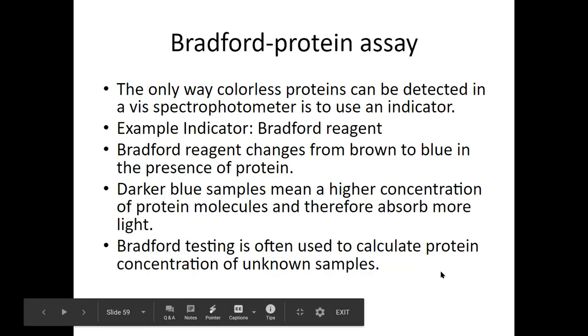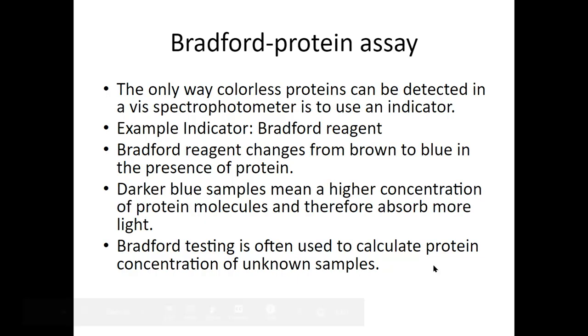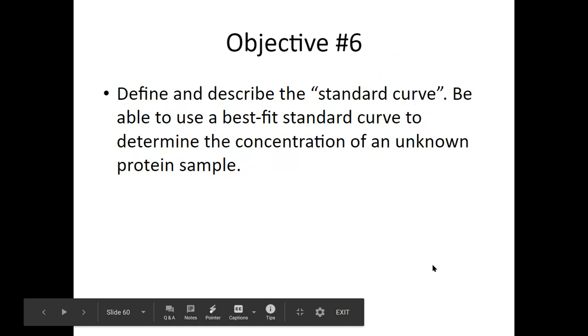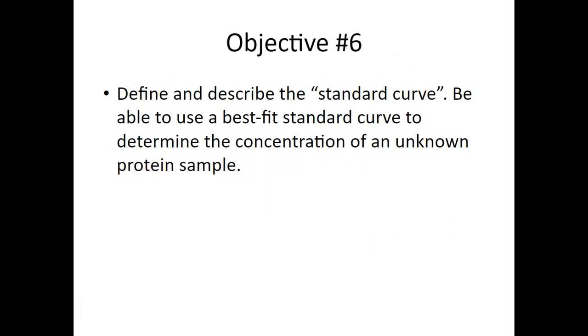Unfortunately, I don't think I'm going to be able to do that. I have protein. I have to see what's going on. I have the standards. I'll see how it goes. Oh, I have a protein assay kit. Yeah, I will be doing it. I think it's Bradford. I have to look back and see.